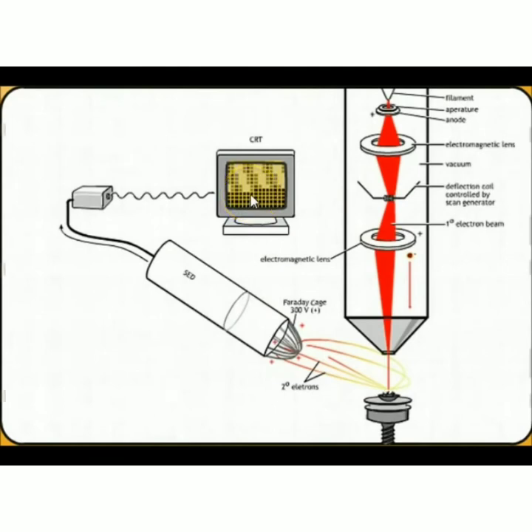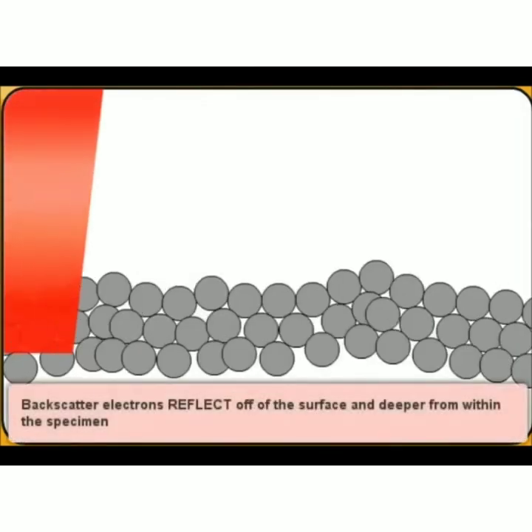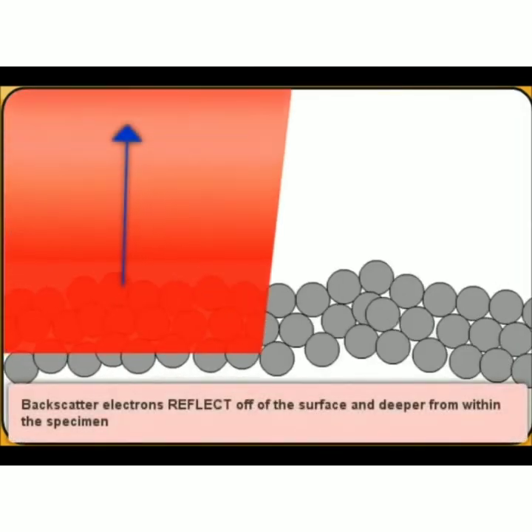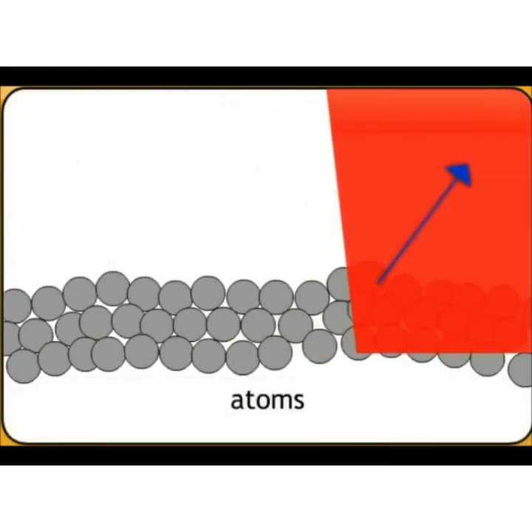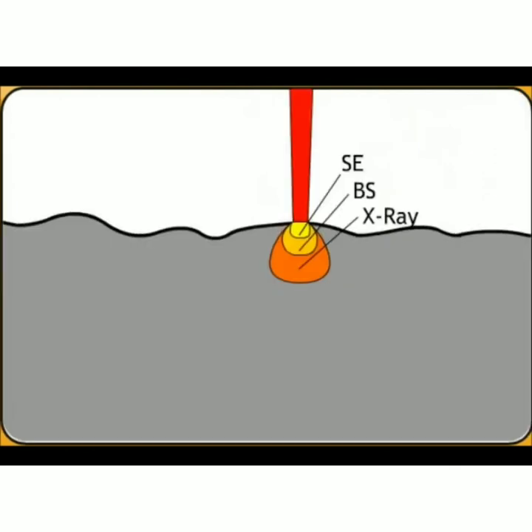Now, the second type of electrons are called backscatter electrons. And these electrons actually don't come from the atoms. They actually reflect off the surface. And they actually can come even from deeper down in the specimen. And we have a second detector that can detect those.